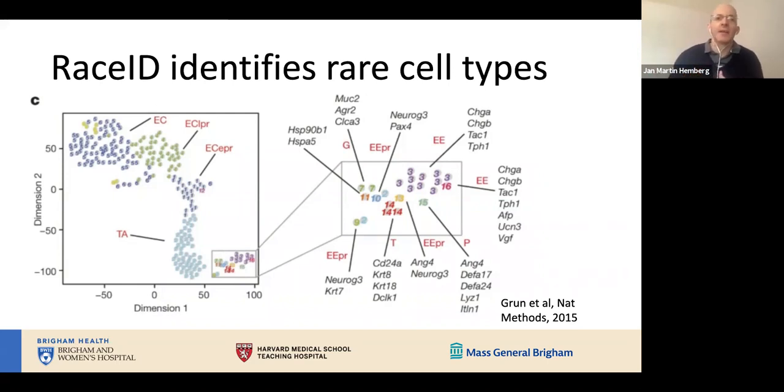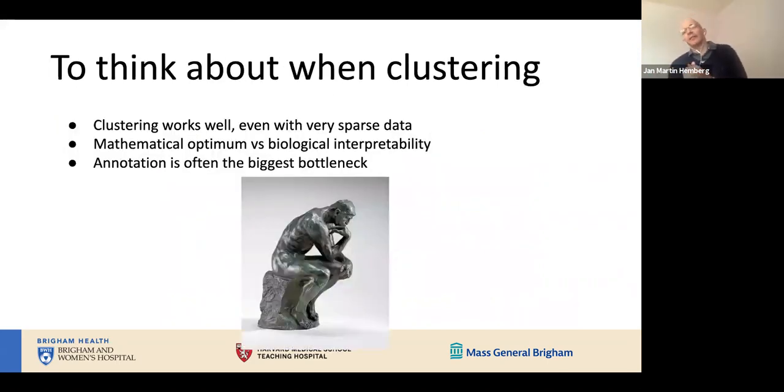So finally, a few words about clustering to think about, because it is a very important step which is part of this analysis, and a lot of what happens downstream is heavily dependent on how you decided to group your cells. So in many projects, this is where you'll be spending a lot of time thinking about which clustering solution is the correct one. And so, some points to think about.